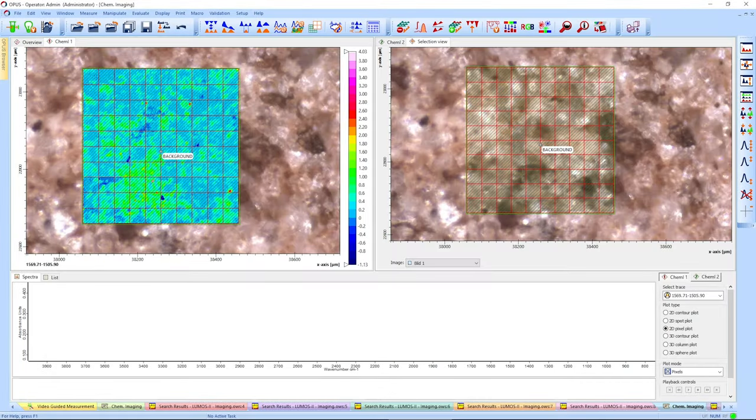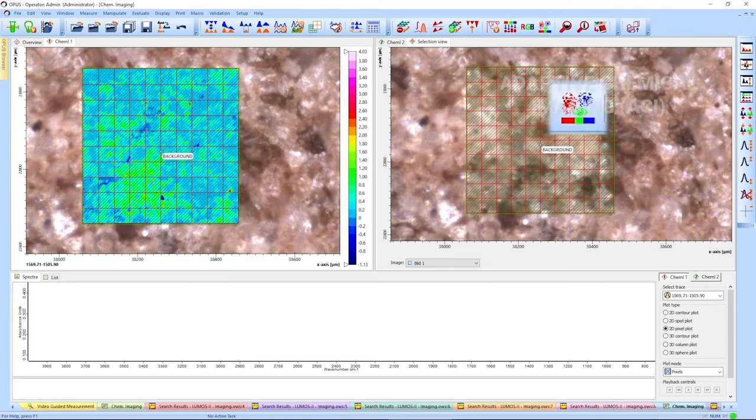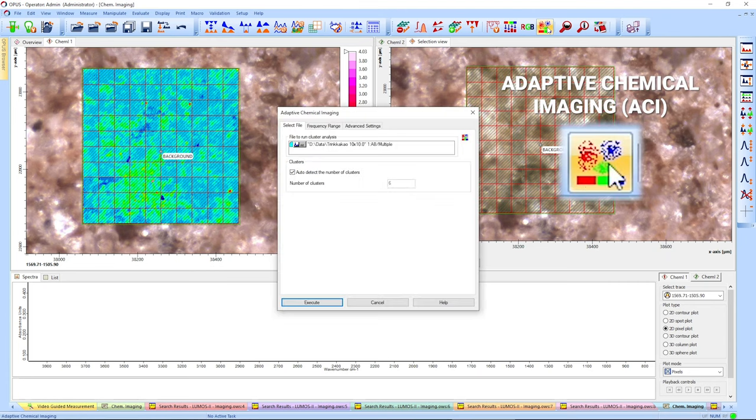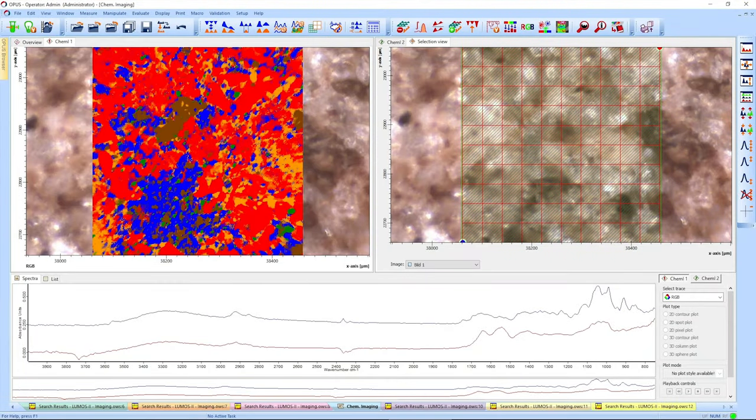Now we have the raw measurement, but we still need to interpret it. I am no expert in hot chocolate analysis, so I am using adaptive chemical imaging and instantly get a classification of our sample.